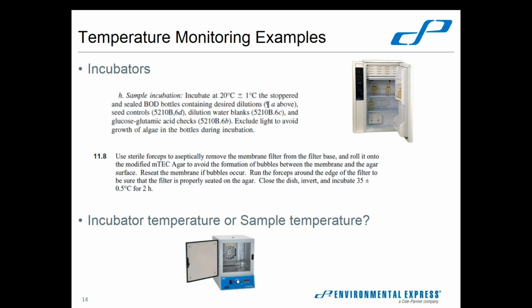Some other interesting things to talk about with your NIST traceable or NIST calibrated thermometers is that a lot of times you should have an actual correction factor labeled on that thermometer. In the lab where I worked, we had some little tabs attached onto the top of the thermometer with a plus or a minus temperature to indicate how far off it was in relation to the actual NIST thermometer.